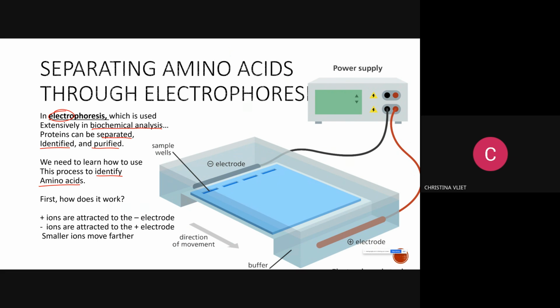But the idea of it is that you have a power supply and you're putting electricity through it.